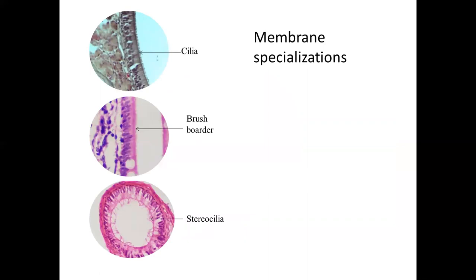Moving on to membrane specializations: there are structures visible in light microscopy and structures requiring electron microscopy. Cell junctions are seen in electron microscopy, but cilia, the brush border, and stereocilia can be seen in light microscopy. This is a slide of the inner nasal wall showing pseudostratified columnar ciliated epithelia with cilia visible. Here you see intestinal simple columnar epithelium with microvilli — that hazy appearance is the brush border. Here you see stereocilia in the lumen, and this is pseudostratified columnar epithelium with stereocilia.